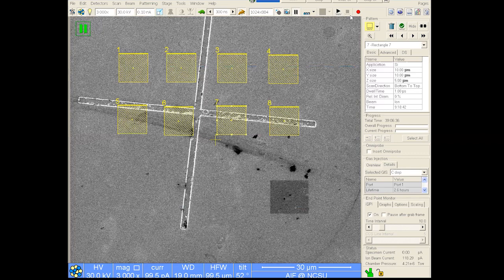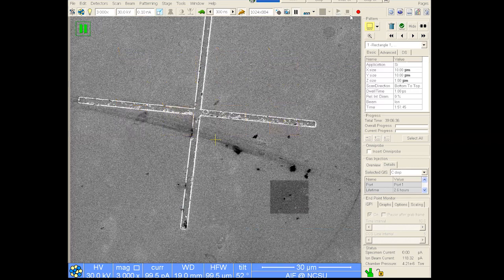So what I can do is basically, let's say I've done my patterning, now I want to go to another area, or I want to go to another sample. I'm going to hit Control-A to select all the features here, and then delete to get rid of them. So again, that's another shortcut that is very common in Excel and Word processing. So you should be familiar with those.